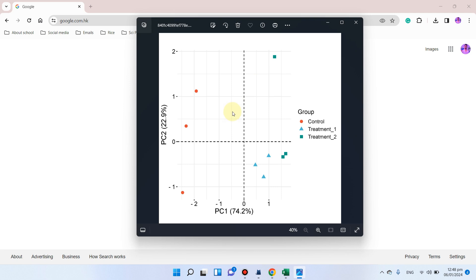Welcome to another video tutorial. In this video I will show you how we can draw principal component analysis using the srplot website.